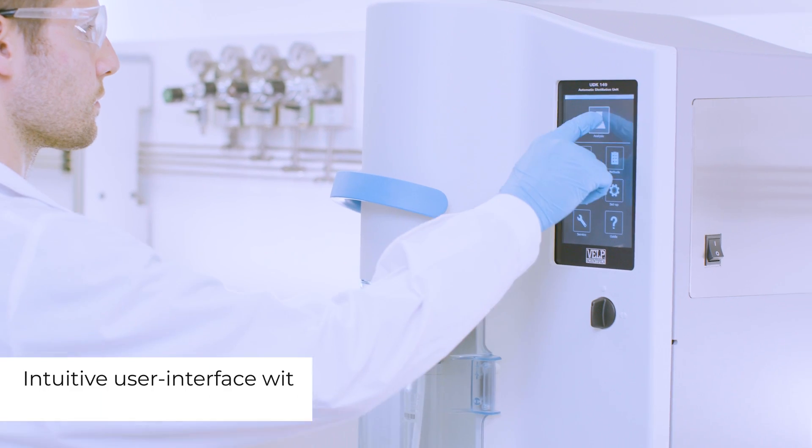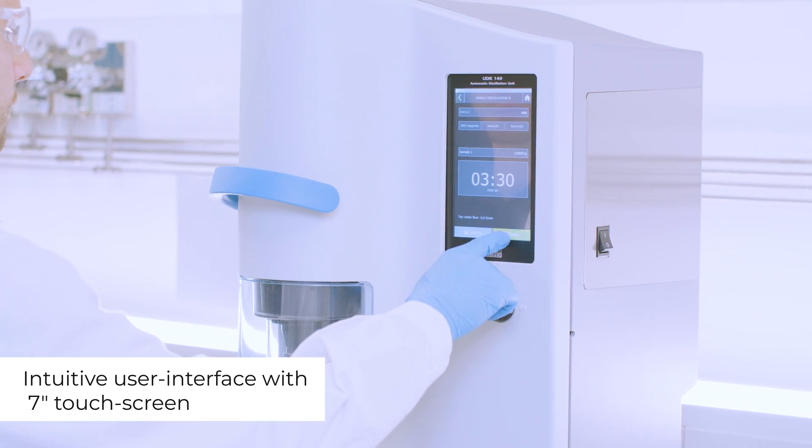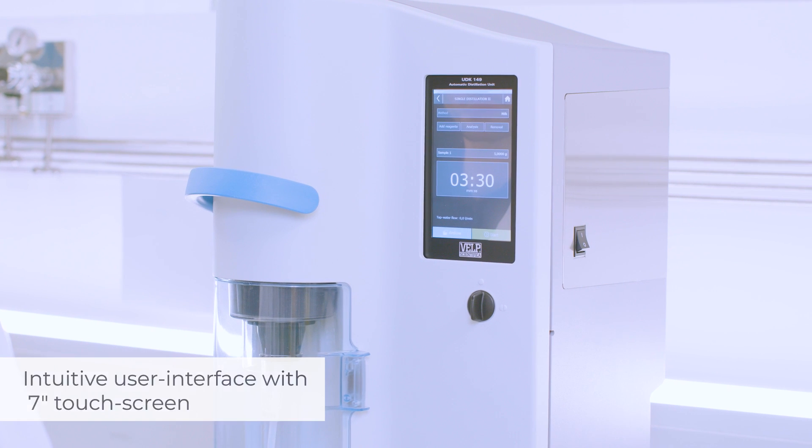The intuitive user interface and the bright 7-inch touchscreen make the UDK 149 a smart and easy-to-use analyzer.